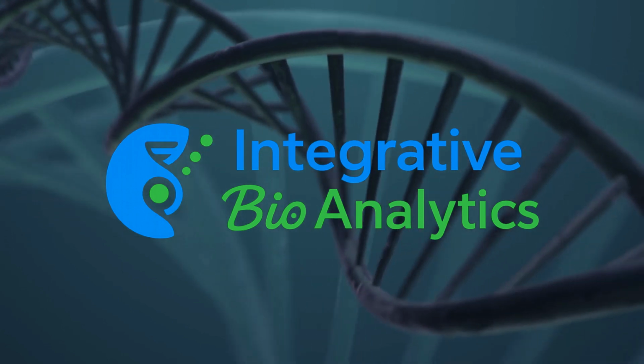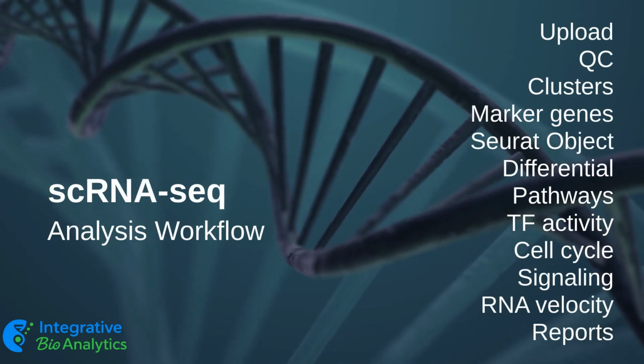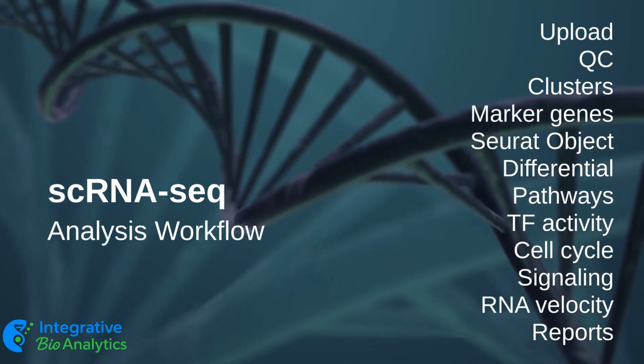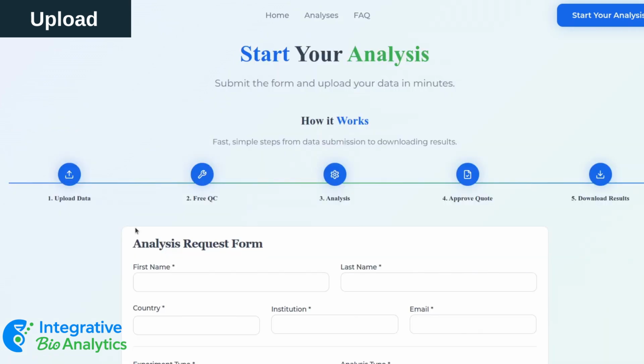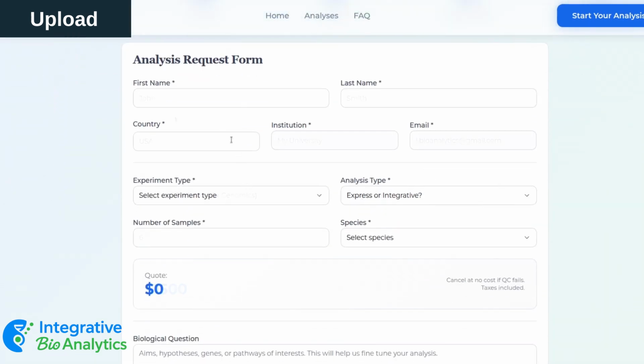Welcome to Integrative Bioanalytics. Today, we will guide you through our single-cell RNA-seq analysis workflow. To start your analysis, simply fill out our analysis form.